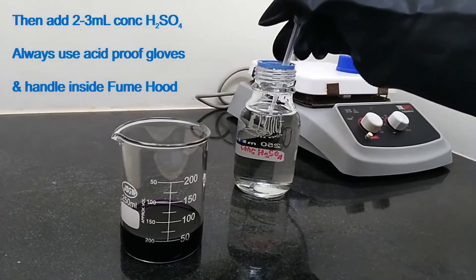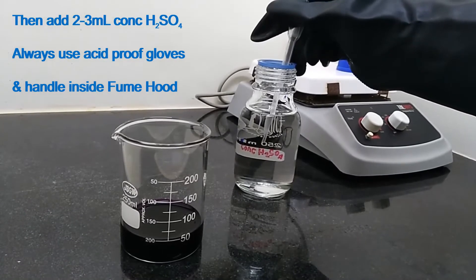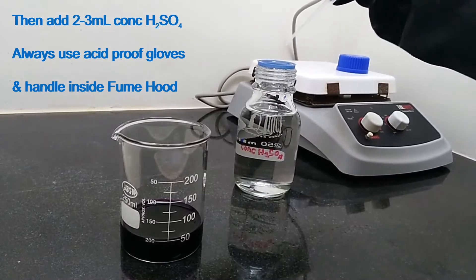Then add 2 to 3 ml concentrated sulfuric acid. Always use acid proof gloves and handle inside a fume hood.